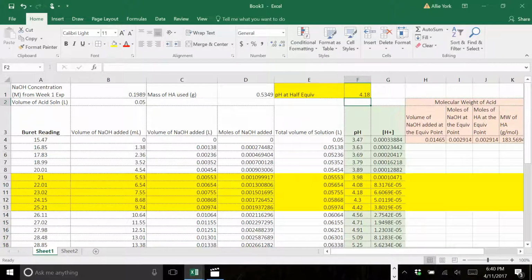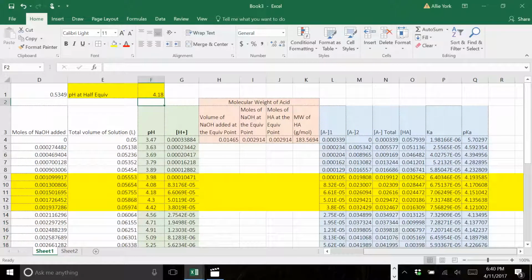There we go. Sorry about that. If you were following along early and you realized I made a mistake, sorry about that. This is why I kept you watching the whole video. No, I'm just kidding. You chose to do that of your own volition. So we have 4.18 over here, which is pretty close to these values. Looks like the average will be about 4.14, 4.15.